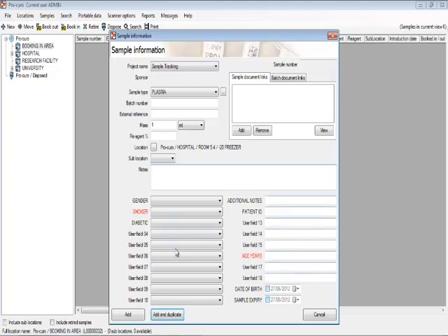At the bottom of the page, you can see your user definable area. Again, your 10 drop-down boxes, 5 text boxes, 3 numeric, and 2 dates. The mandatory ones come up red. So the user of the software can see it very clearly that these must be filled in.